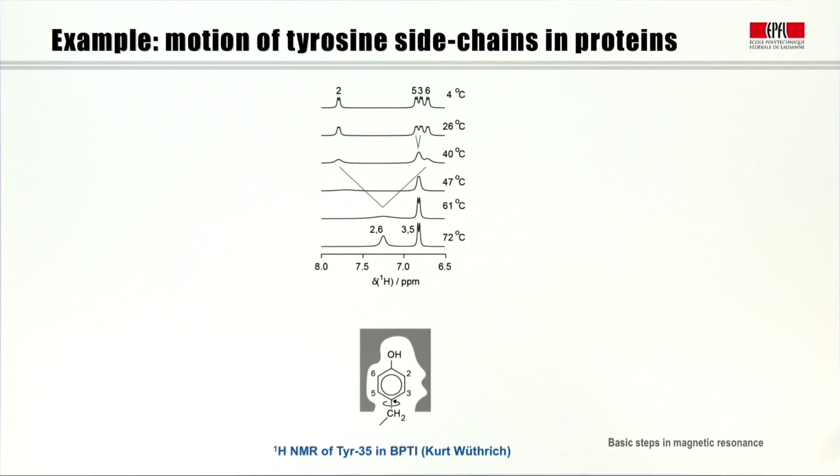In the second part of chapter 2, I try to summarize the mechanics, the mathematics that underlies the description of the so-called McConnell-Bloch equations, which allow one to derive such things as line broadening, line narrowing, coalescence, and all these things on a more serious basis rather than pure empirical discussions. Now, Peter Hoare has collected a remarkably well-selected set of examples of chemical exchange.